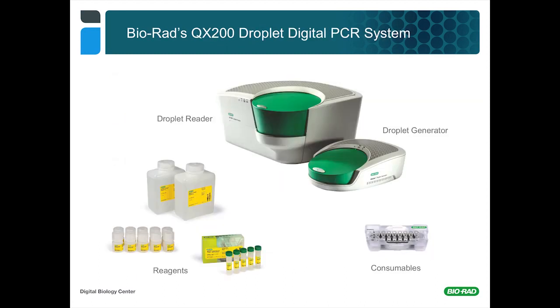Okay, so I want to move on now to giving you a little bit of an overview of what Bio-Rad's QX200 droplet digital system looks like in terms of components. This is essentially very similar to what the previously launched QX100 system looks like, but has some improved features. At the top here are the two instruments. There's a droplet generator, the smaller instrument to the right, and a droplet reader to the left of that.